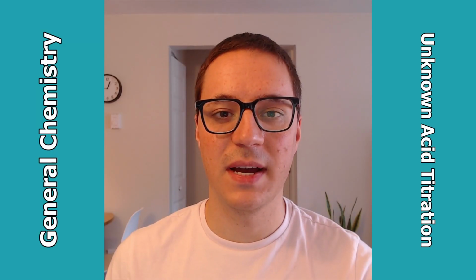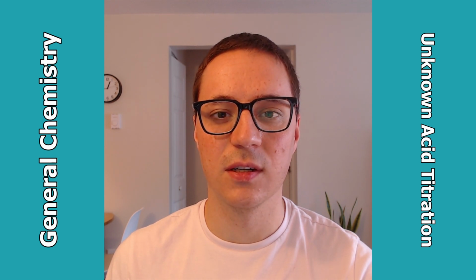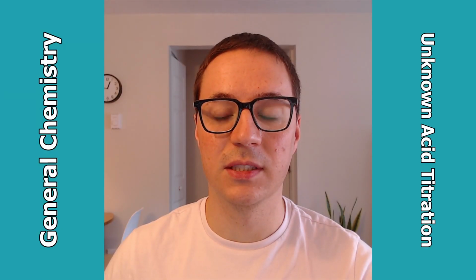Before I compare this mass of KHP to the mass of the unknown, I've got to keep in mind that in this procedure, we split up that unknown that we weighed out. What we actually titrated was just that 25 milliliter sample that we pipetted out of the volumetric flask. So I need to find the mass of unknown mixture that made it into that 25 milliliter portion.